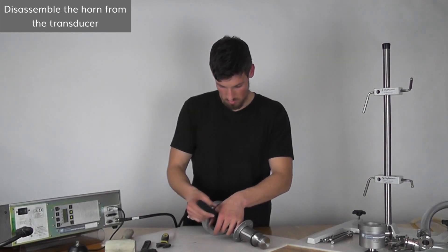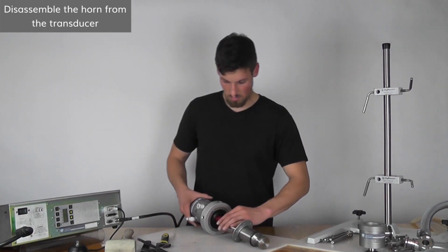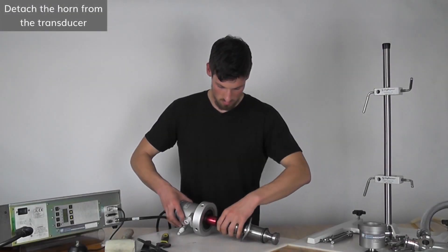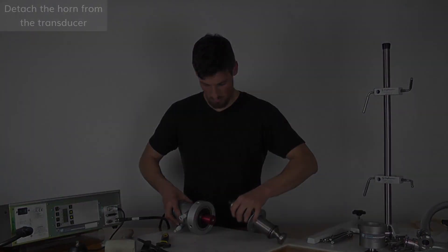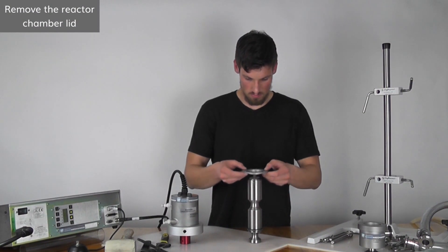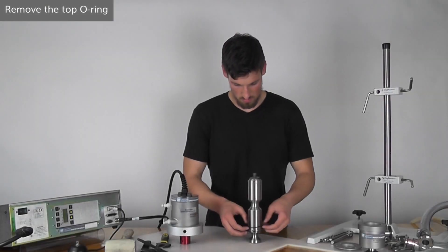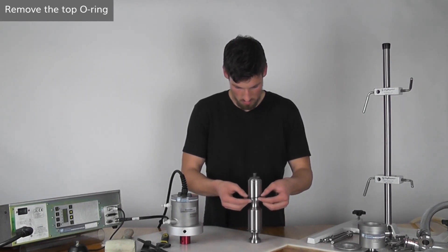When the barbell horn turns with respect to the transducer, remove the wrenches and continue by hand. Remove the reactor chamber lid. After, remove the top o-ring from above the flange of the barbell horn.